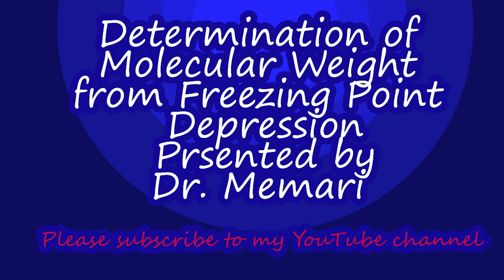In experiment 11, we are using colligative properties. So what are colligative properties? Colligative properties are properties that depend on the number of particles associated with that solution. They could be boiling point elevation, freezing point depression, or changing osmotic pressure. So these are some of the colligative properties, and it depends.